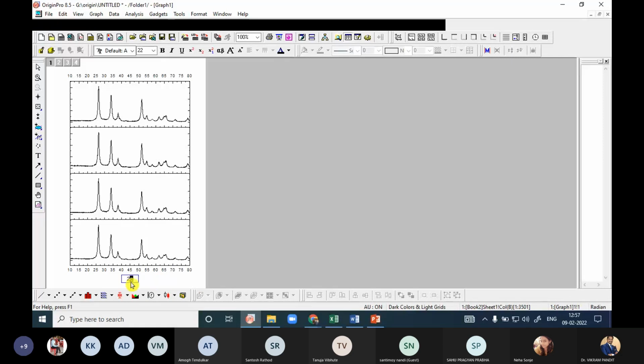I will select that q, and here alpha and beta is given. I will click on this alpha and beta, and I will get a theta. These are shortcuts. The shortcuts are given on the internet also, but as per your need, you can convert this.